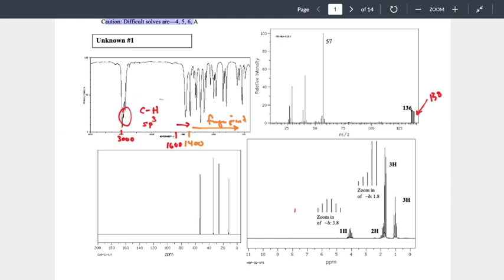That's what's happening. That's rare. I've seen maybe 1 instructor do that to students. I think that's a bit out there. What I stick with is if it's odd, you got a single nitrogen. If it's even, no nitrogen. So in this case, it's even. It's a bit of a stretch, but we can make the statement no nitrogen.